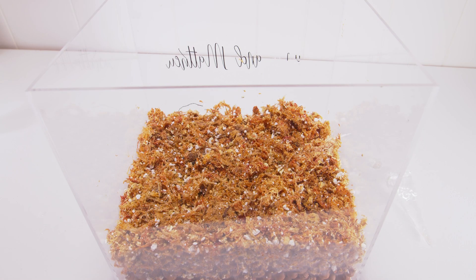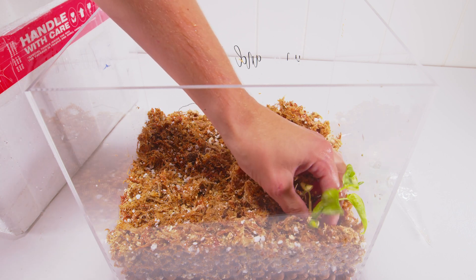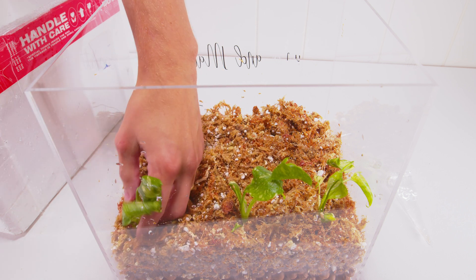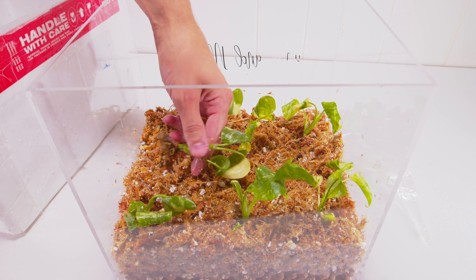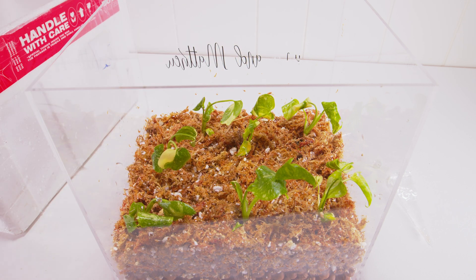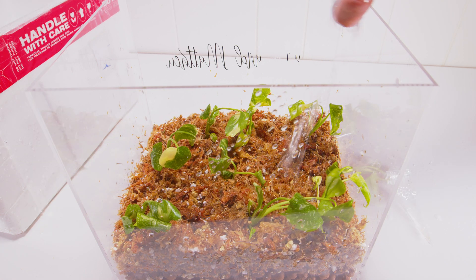Once you get them all cleaned up, we are just going to stick them in the sphagnum moss. Make sure all the roots are covered nicely and everything is really good and wet. We need to keep that 100% humidity for a while while they get used to being in a world with bacteria, funguses, and other little organisms. They've got to get used to this non-sterile environment, but we don't want to shock them with a very low-humidity environment.